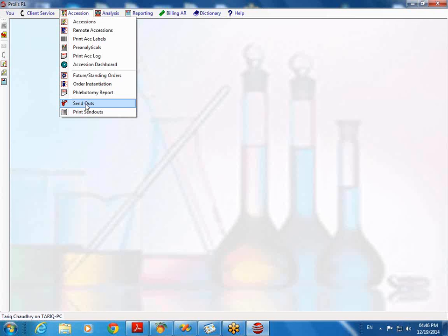And the report which I just showed you a while ago, which report was that? I'm so forgetful. The RPT4. Yeah, RPT4. What was the test on this? Which I showed you different fields. I apologize. Let me pull that again.